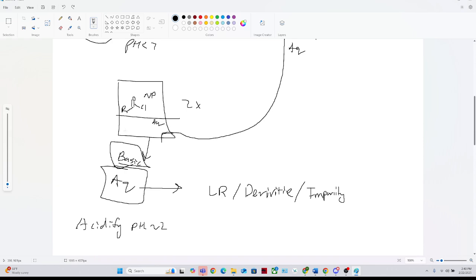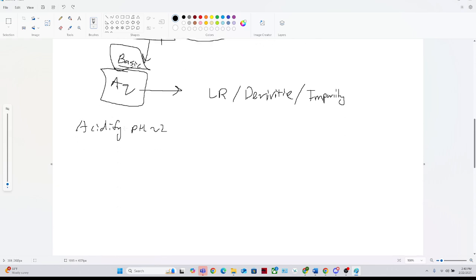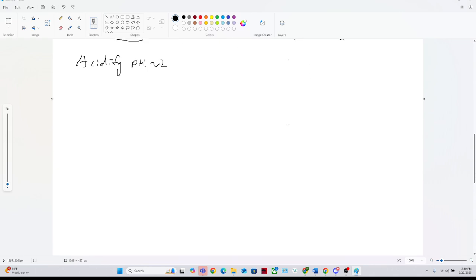So you have to be cognizant of the pH. Going to pH 2 is specifically used to ensure your carboxylic acid is protonated, but you don't want to go so acidic that you start catalyzing an unfavorable reaction that would drive more impurity from your derivative, okay? So you have to be very cognizant of the pH.